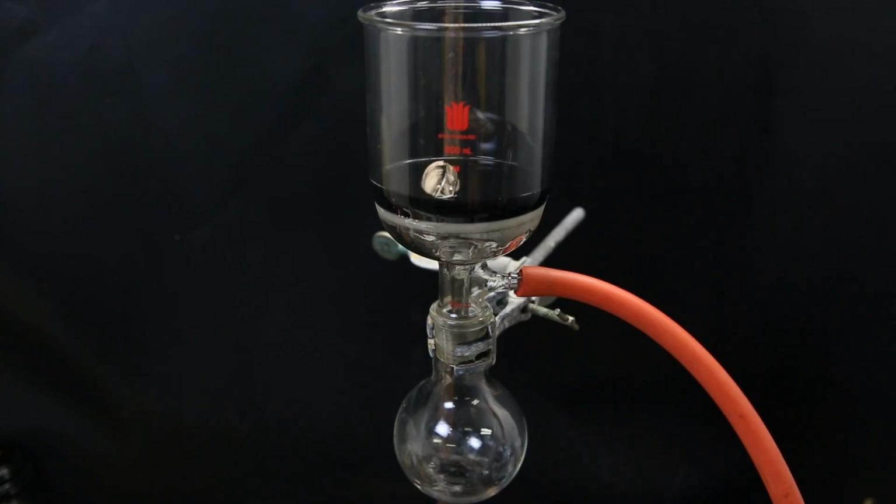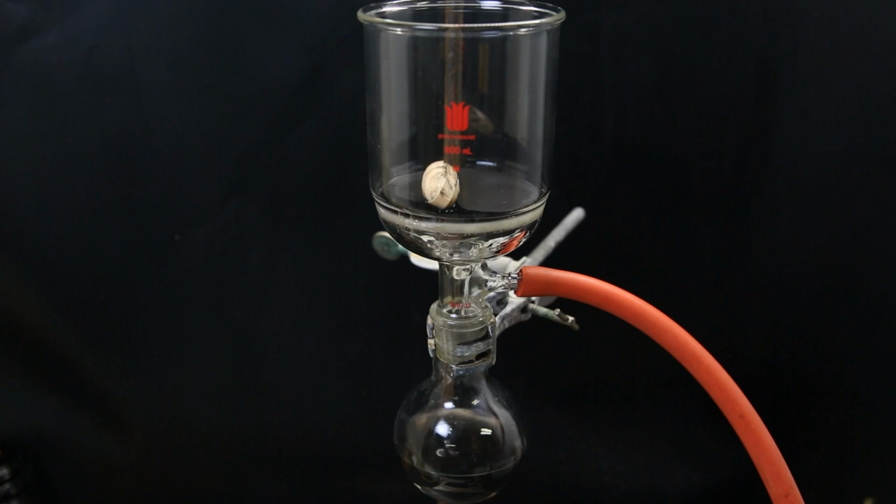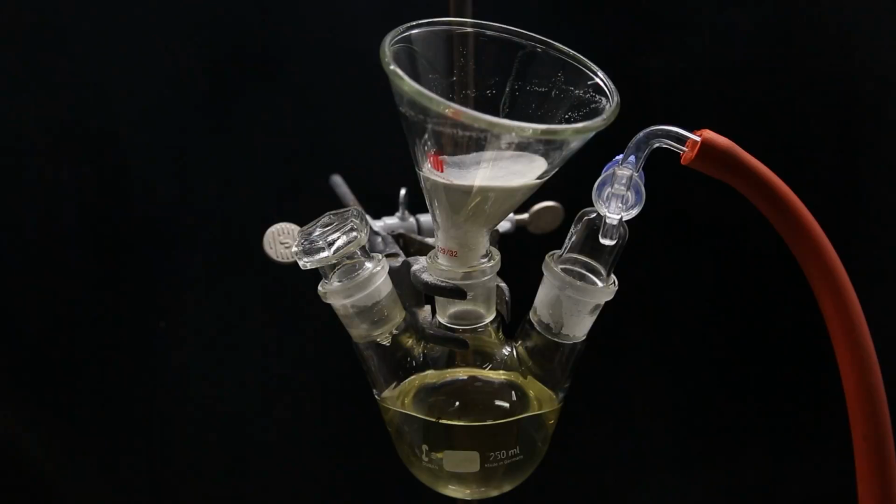Now I filter the mixture through a glass filter and wash it with more isopropyl alcohol, but still some carbon particles come through, so I refilter it through some cotton and celite. Since it was really slow, I changed the flask and attached the gas adapter to pull a vacuum and pull it through faster. I also washed it again with more isopropyl alcohol, and the filtrate came out as a clear yellow solution. Since the solution was red before the hydrogenation, it is a good sign that something has happened.